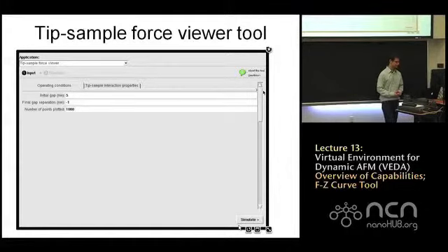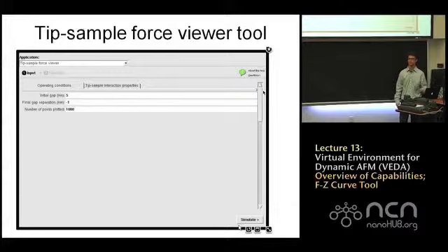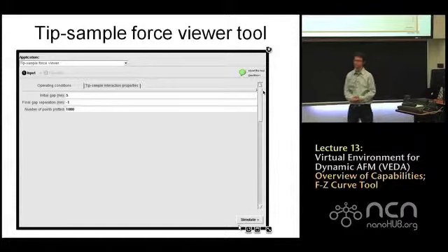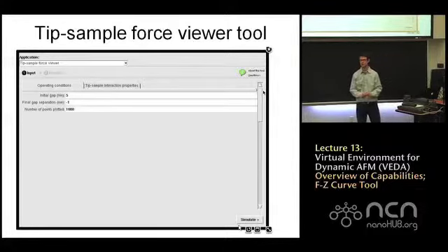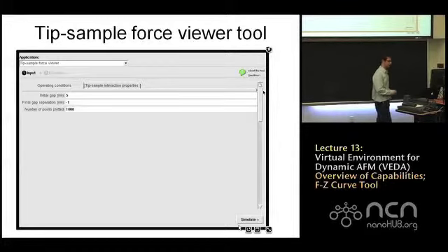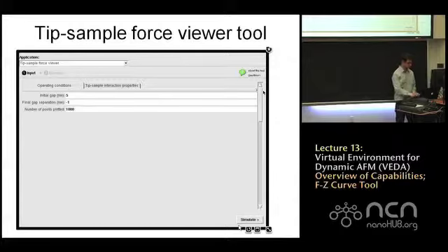Okay, so when we select this, you'll notice that there are tabs at the top of the page, and these have different input parameters on them. The first one that comes up is what we call operating conditions. For this, I just want to change the input for the initial gap to 5 nanometers and the final gap to -1 nanometers from the default inputs. Okay.